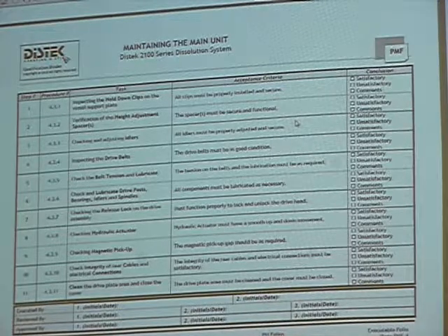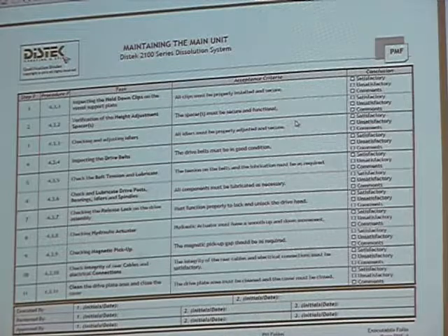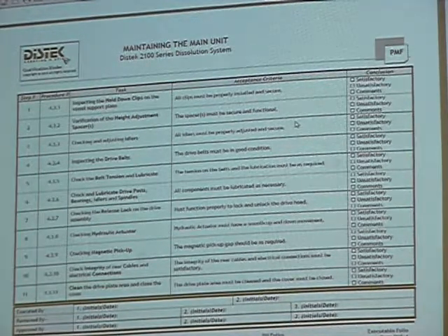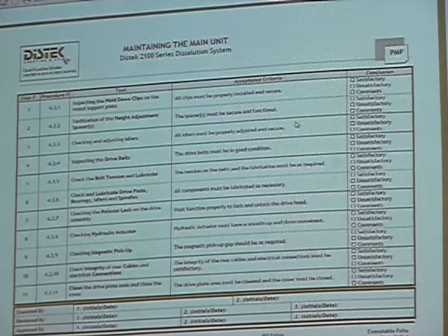as it's going around. The reason being is heat rises. That heat is rising, it's making that belt nice and brittle. Over time, it's going to crack, it's going to break, pieces of it are going to chip off. I'm sure you've pulled the lids off of our units and seen black all inside there. That's pieces of the belt breaking off. If you lube it up, it helps to make it remain pliable. It doesn't have to be adjusted as many times, and will last a lot longer. Again, because that heat is rising and it's just drying it out. So every 6 months when you do a qualification, I always put a nice little thin layer of it back on there again.